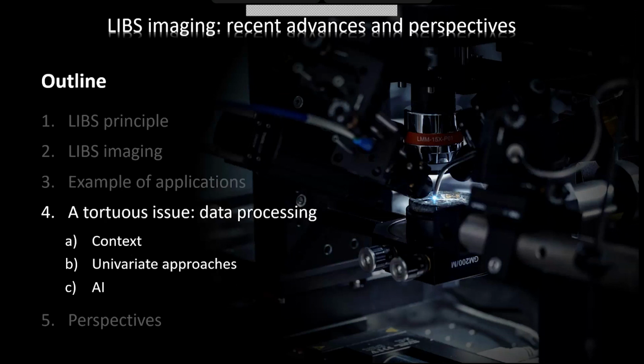So we have to develop some tools. I don't know if they're the best tools, but we have to develop the capability of processing the data. If we increase imaging, now, I will show you in perspective, but now we can record a 1 million pixel image in 17 minutes. So 10 million in less than 3 hours. But it makes no sense if you need 1 year to process this data.